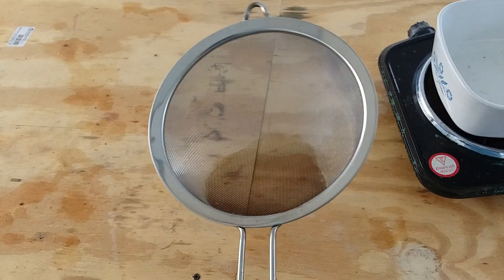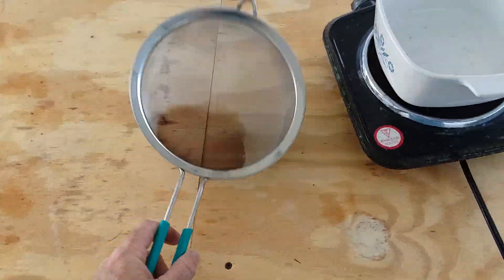The stainless steel in the sieve replaced some of the gold in solution, and the gold cemented out on the sieve. Every stinking bit of gold in that solution wound up on this sieve.